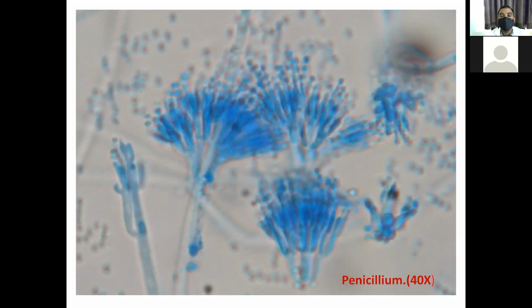This one is cellophane tape. A piece of cellophane tape is gently laid over a portion of the fungal colony, and slowly lifted to remove an area. You put one drop of LCB on a microscopic slide, stick the tape onto the LCB, and cover it with a cover slip.